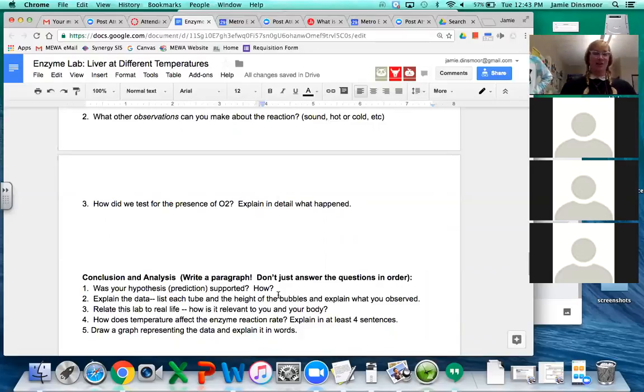Okay, so I just took a whole chicken liver here. We're going to pour a lot of hydrogen peroxide. Let's see. What happened? This might be the best stick. I broke this off a birthday candle, one of those decorative ones.